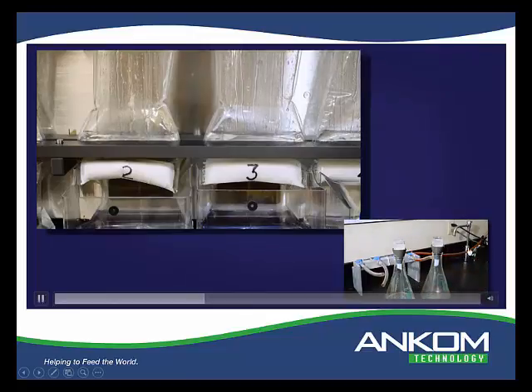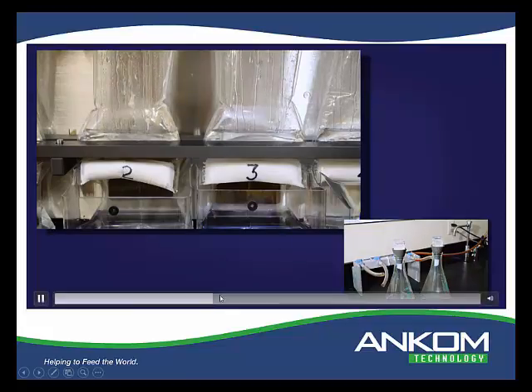Back down here in the conventional, the oat bran is still filtering here. The pectin is filtering, and I'm still having to continue to put solution in there because of the slow time it takes to do that. So rinses are taking place here. Let's go ahead and speed up again.